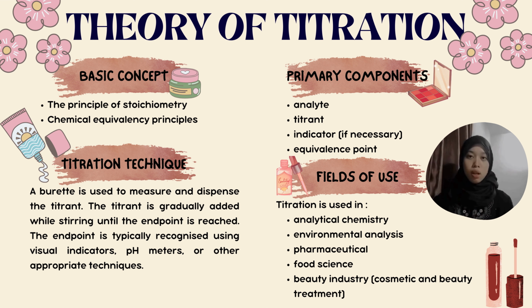Second, titration technique. A burette is used to measure and dispense the titrant. The titrant is gradually added while stirred until the endpoint is reached. The endpoint is typically recognized using a visual indicator, pH meter, or other appropriate technique.